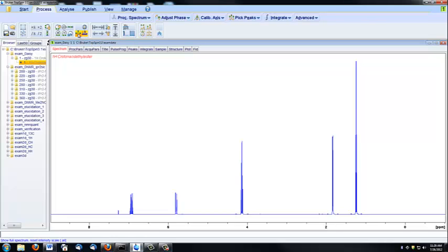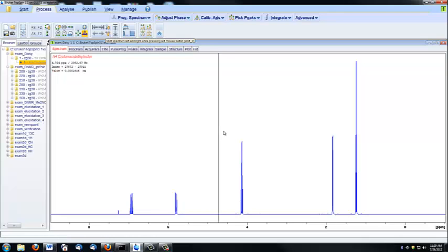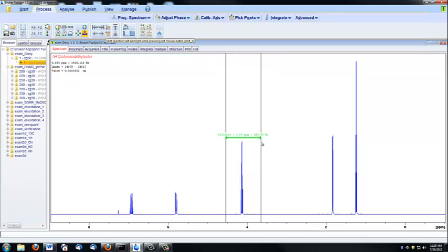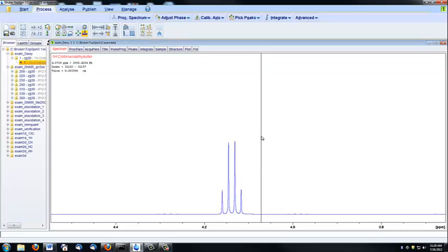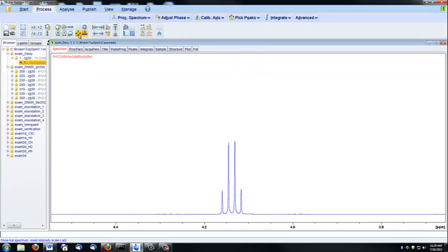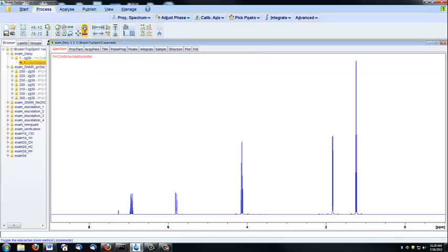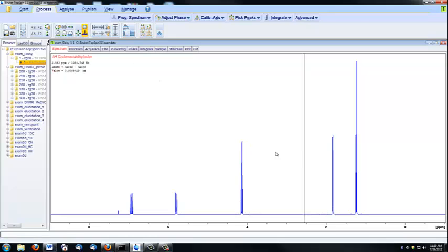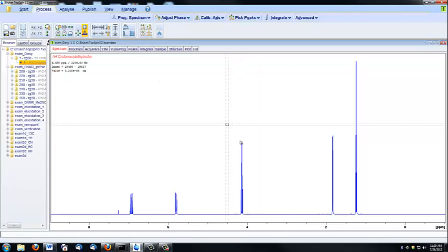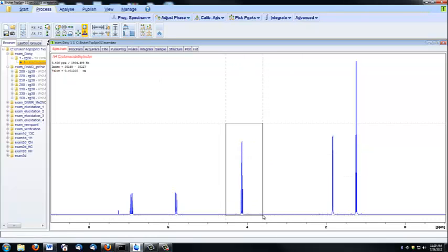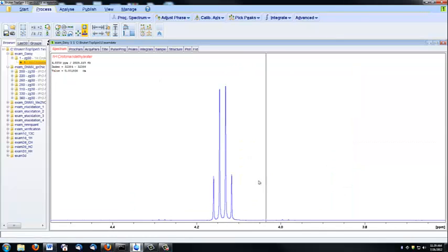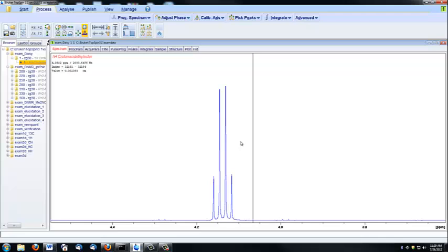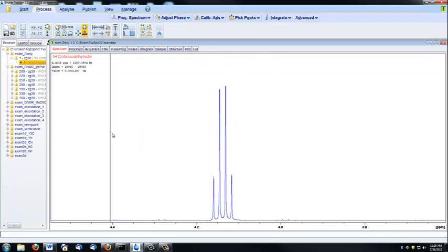If you want to zoom in on a certain section of the spectra, you can simply click and drag over a region and it will zoom in. Or, another option is you can toggle the interactive zoom method, which will allow you to box in a region. This allows you to also set the intensity of the peak.